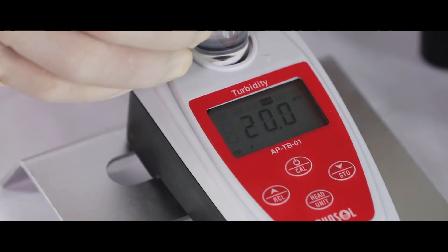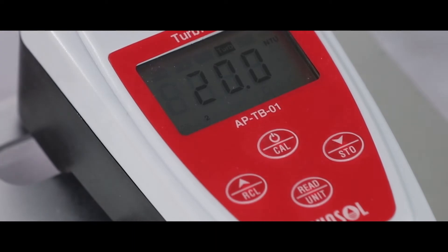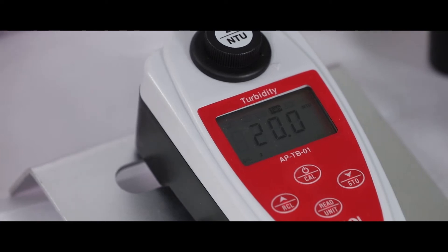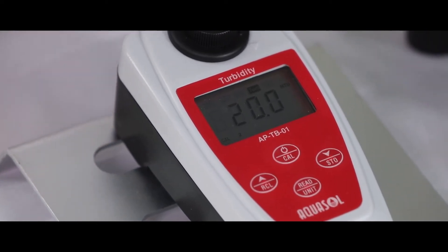Press the read key for calibration. The CAL icon will start flashing on the display. Once 20 NTU calibration is done, the meter will display 100 NTU and CAL 3.